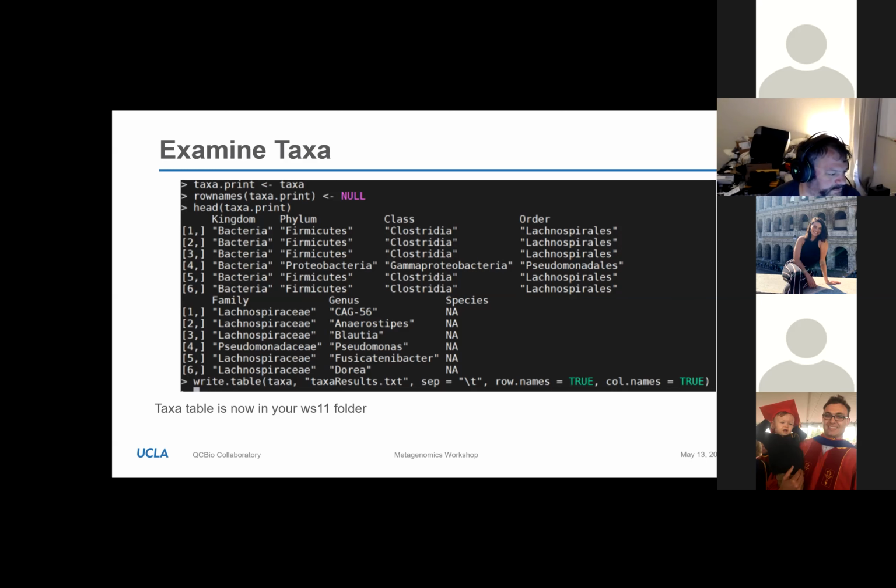Yes. So Vivian is asking, where are these taxonomic assignments coming from? Are they being pulled from a reference? And the answer to that is yes. You'll notice that in your data file you have 4 files ending in FASTQ, and those are obviously reads. You also have another set of files in there that involve the name Silva, and that's using the Silva database of ribosomal RNA sequences. That's the database that's tying together ribosomal RNA sequences with what species they originate from.